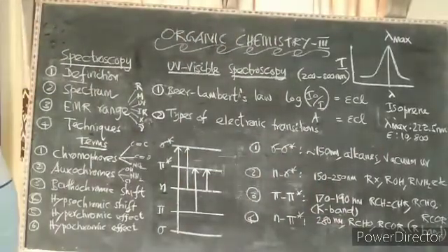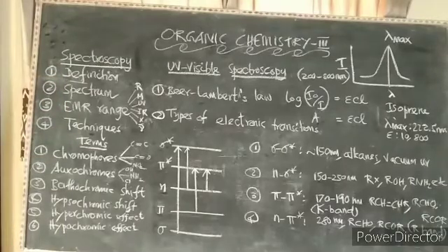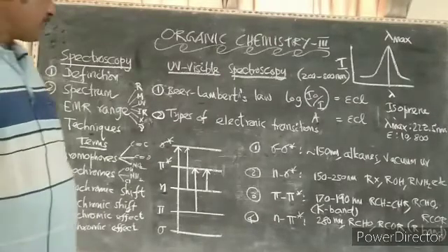The molar absorptivity is represented without any units, but the wavelength of maximum absorption is represented in nanometer.